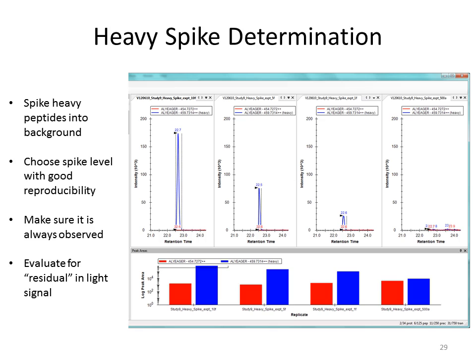For high flow, I might do 10 to 20 times that injection amount, which means 10 to 20 femtomoles per 10 to 20 micrograms, right? So just knowing that, you can begin to set up a quick experiment to evaluate how much heavy to spike.